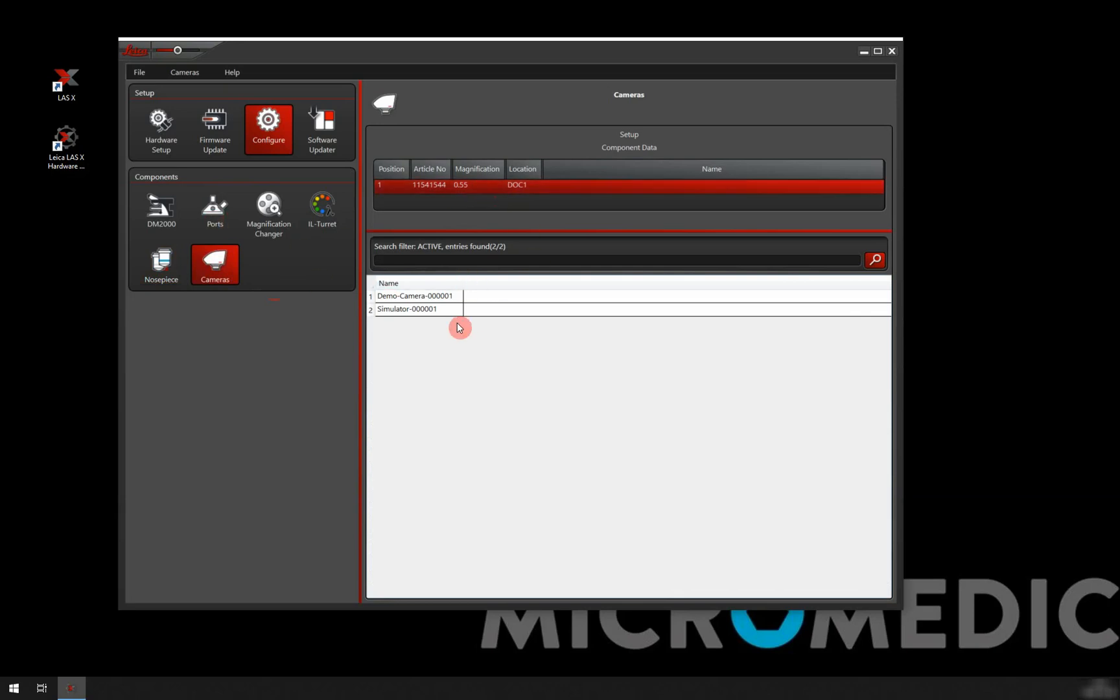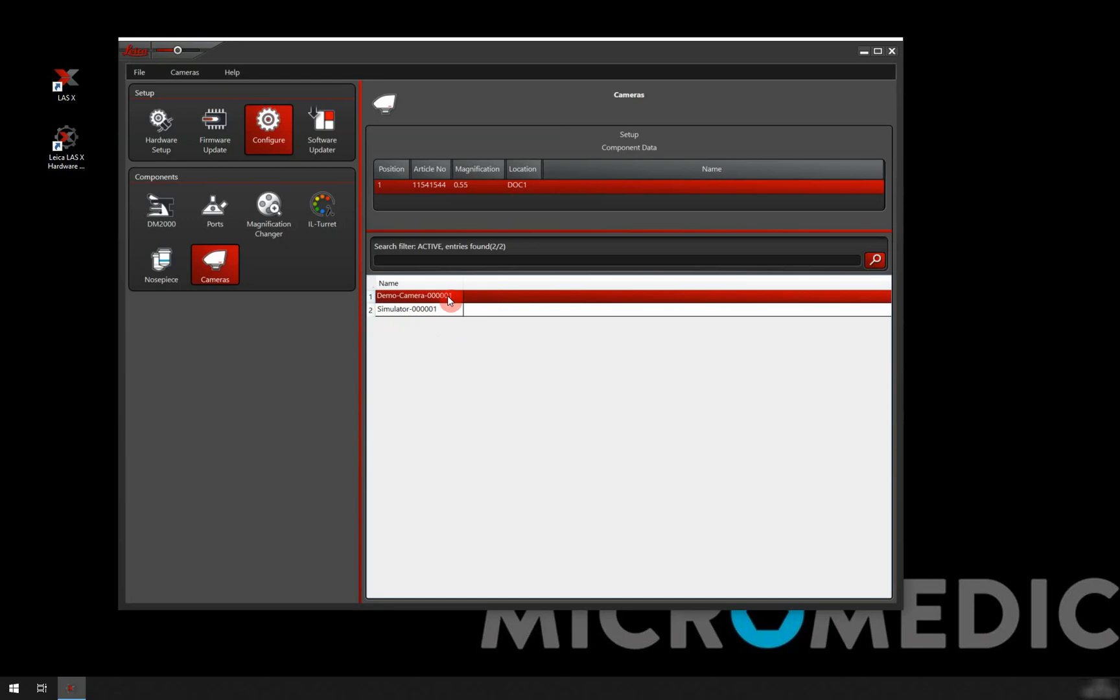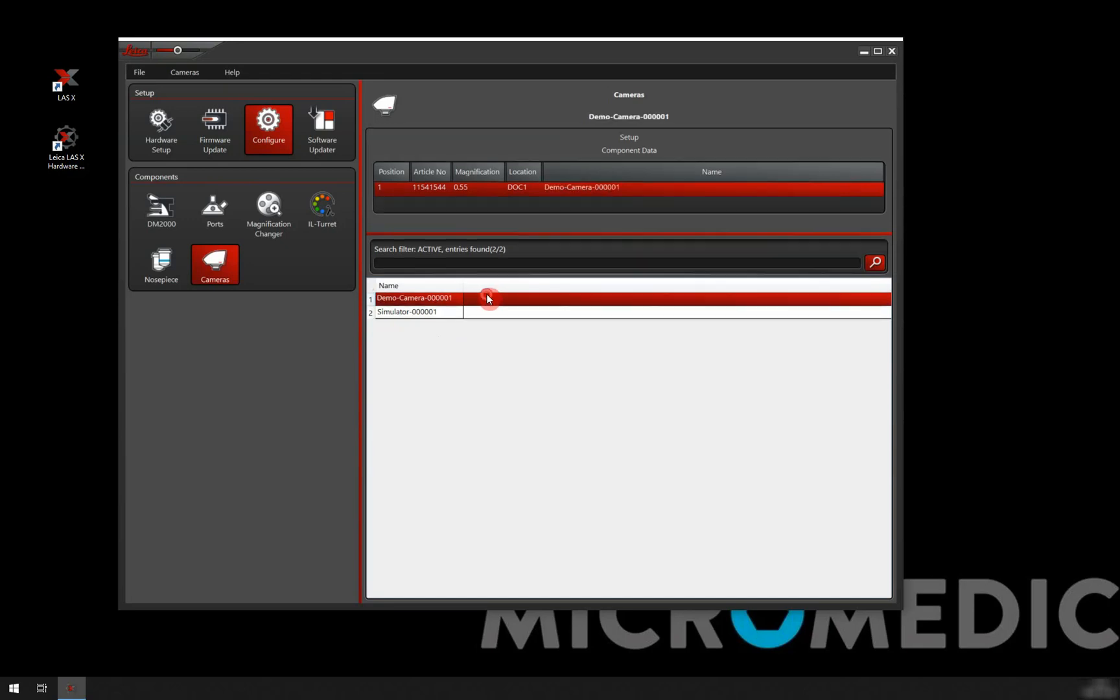On this computer, I don't really have a camera connected to it. So for me, I only see demo camera and simulator. But if you had your camera connected, it would show up here and you basically just double click on that. I would just choose demo camera and I double click on that and we'll see that it pops up.